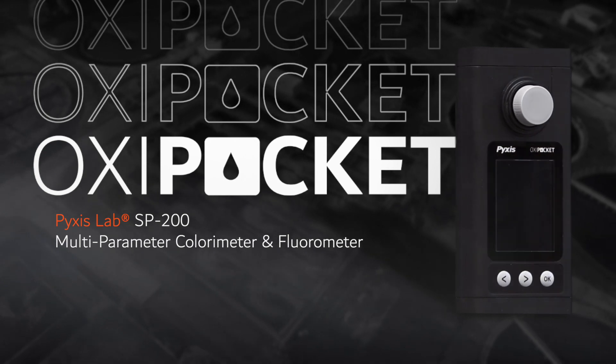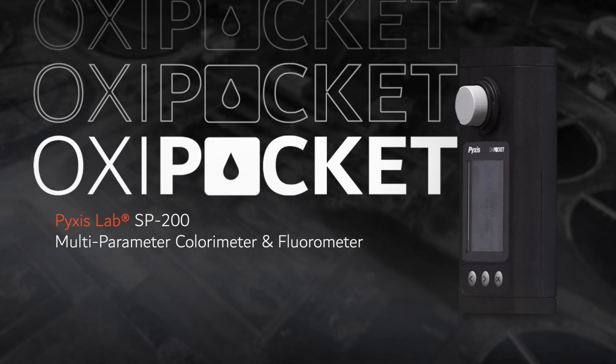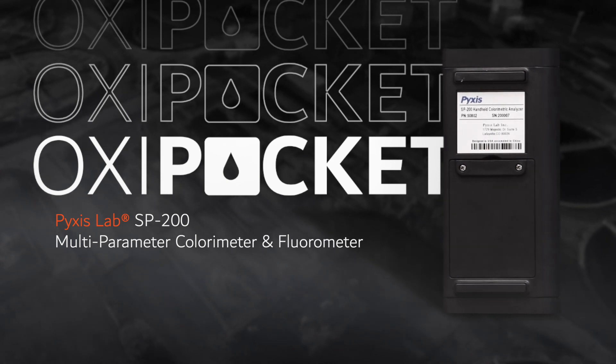Pyxis Lab is pleased to announce the launch of the SP-200 OxiPocket. This new handheld device is a multi-parameter pocket colorimeter and fluorometer designed for users desiring an affordable and portable device capable of testing all commonly used primary and secondary oxidizing biocides and disinfectants.